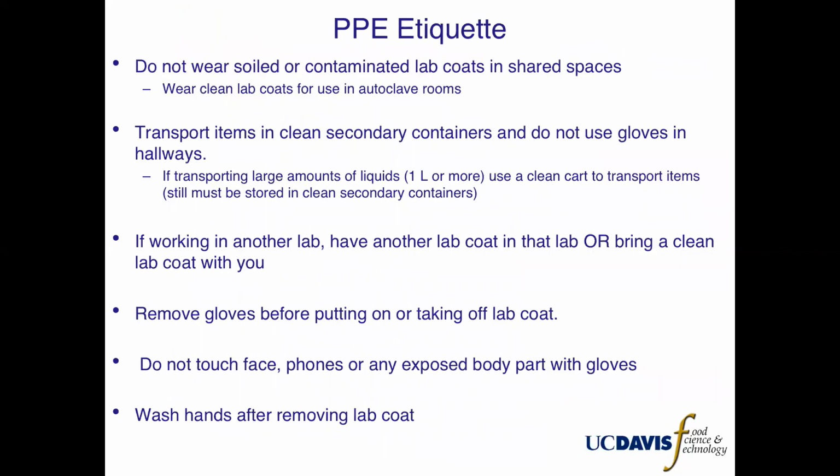I would like to discuss some PPE etiquette. Do not wear soiled or contaminated lab coats in shared or public spaces. This is true for both chemical and biological contamination. Wear clean lab coats for use in autoclave rooms.